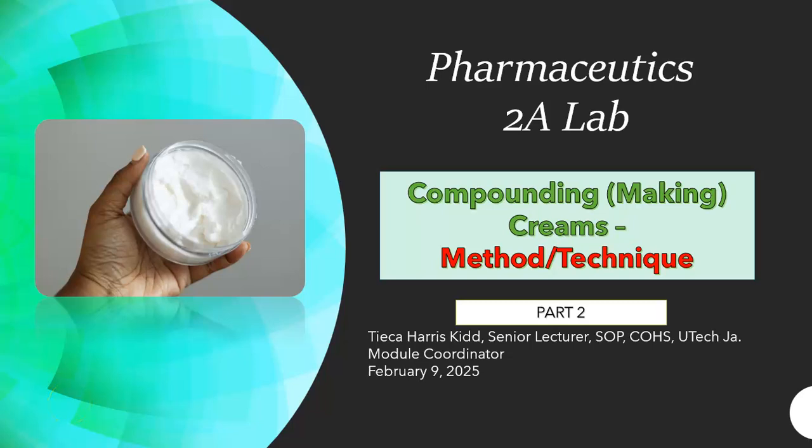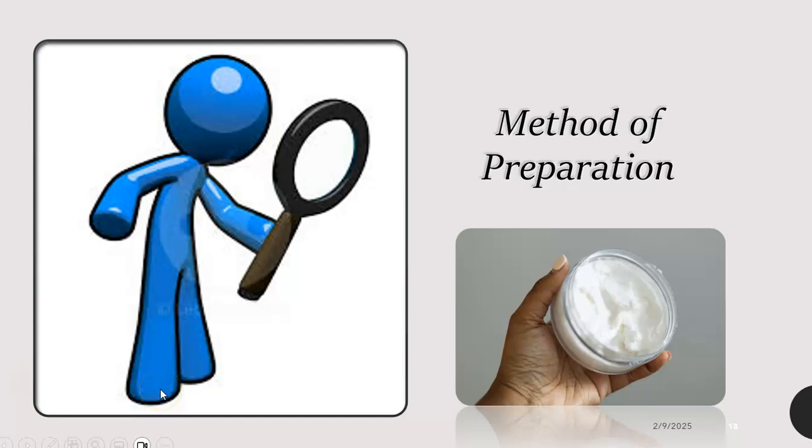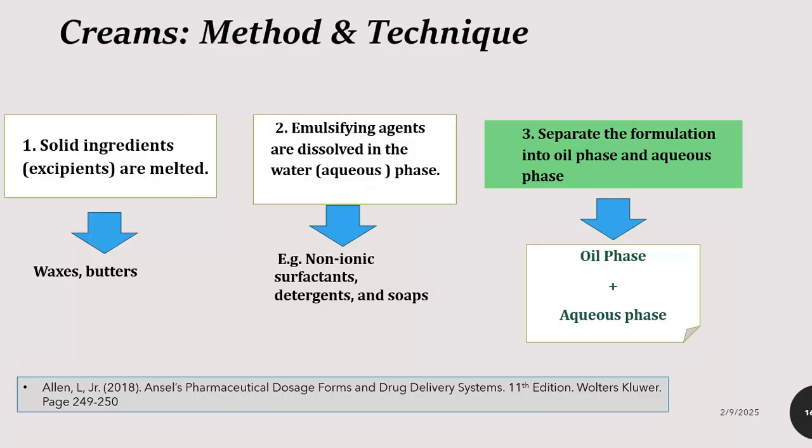Welcome to part 2 of compounding creams. In this video, we are going to be looking at the preparation of creams.